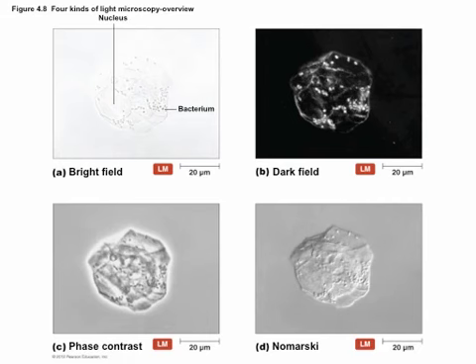Yes? Has there been a preferred microscopy? Like out of these groups, is there any true one that has been preferred over the others? Depends on what you want to do with it. But I would say for microbiologists specifically, if you're looking at bacteria and not human cells, not really eukaryotic cells, big complex things, if you're looking at really tiny things that don't have super complex insides, most of them start off looking with phase contrast.